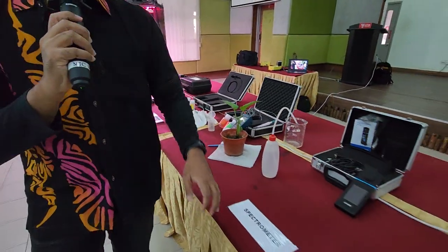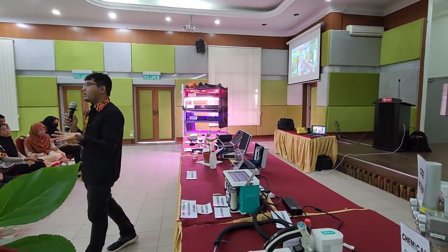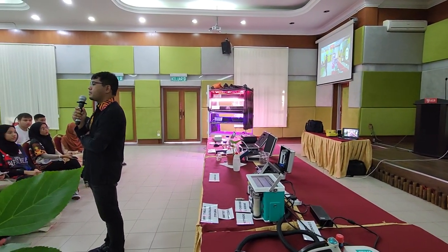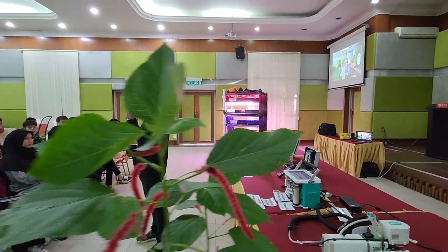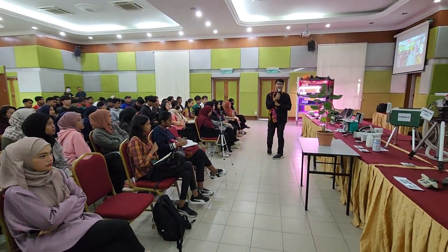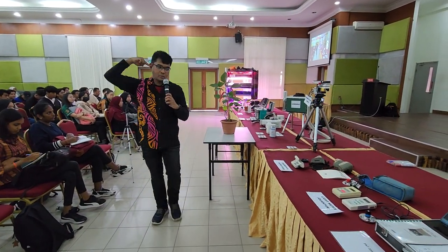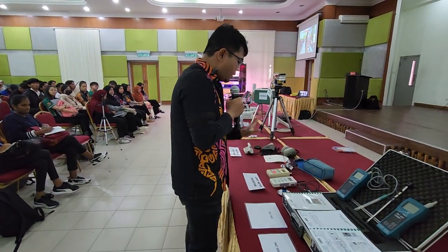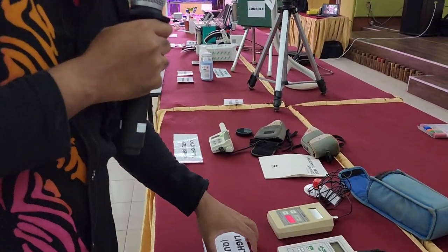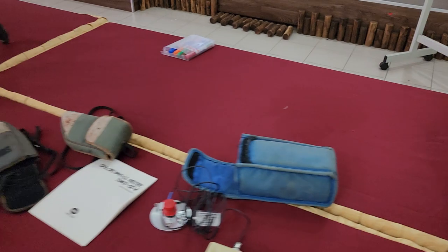All right. So we have dealt with gas, soil, water. What else is there? What other factors can we measure that surround and influence plant growth and development? Light. Yeah, light. Temperature. Temperature, you know, just put it in your ear. 37. Got it. Can we bring it over here? This thing.